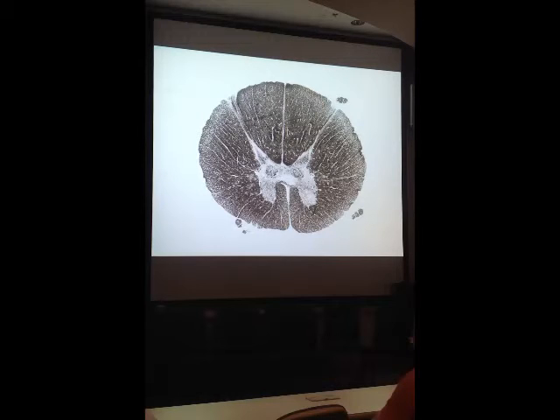And if you can tell it's thoracic cord, which you should be able to do, then a couple of unique features should be found on this slide. You might want to remember this. On thoracic cord, a couple of unique features. One is that there's an extra horn in addition to the dorsal and the ventral horn. So there's a little bit of a lateral horn right here. It doesn't show as well over here, but here's the lateral horn on this side.